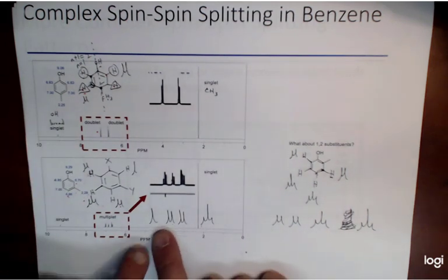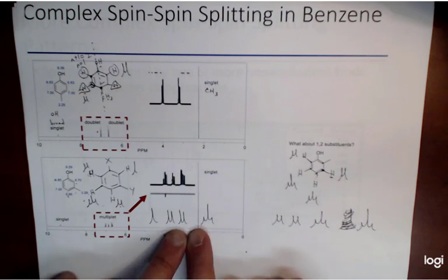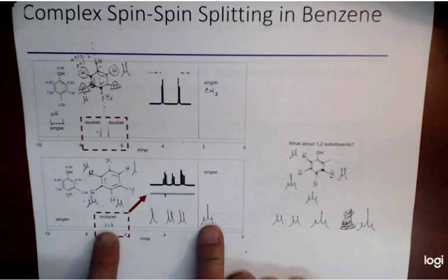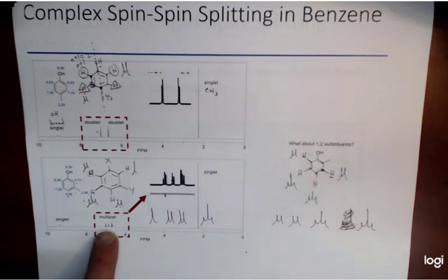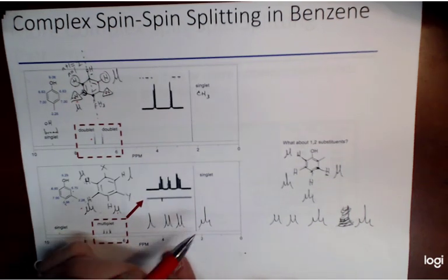So what we would see if they were highly resolved, which they're not, unfortunately, is something I would point out to you if you needed to see it. If you were given that spectrum, I would say this is actually a singlet, two doublets, and a triplet, so that you know it's 4 different signals, and it gives you an idea of what the structure is. What we see here is 4 different signals: a singlet, 2 doublets, and a triplet.